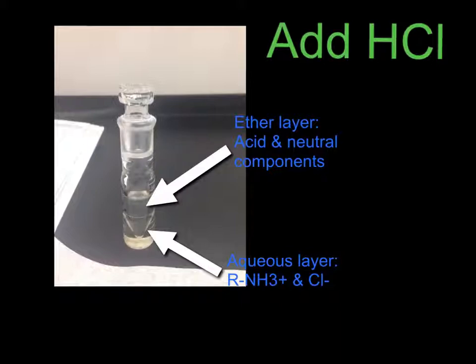The same applies to the acidic component, which is deprotonated by adding base, the sodium hydroxide. Always remember the stopper needs to be placed on the distilling receiver if you are not adding anything, because the ether evaporates really fast under the fume hood.